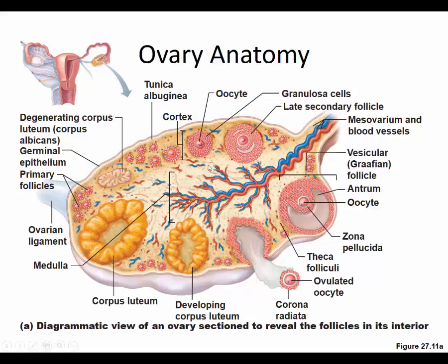So here's an ovary. On the very edge are these primary oocytes, and the cells around them are called follicle cells. They just nourish that nucleus, that developing oocyte. So they're just supportive cells. And they're much smaller, sometimes found near the edge, but not always.